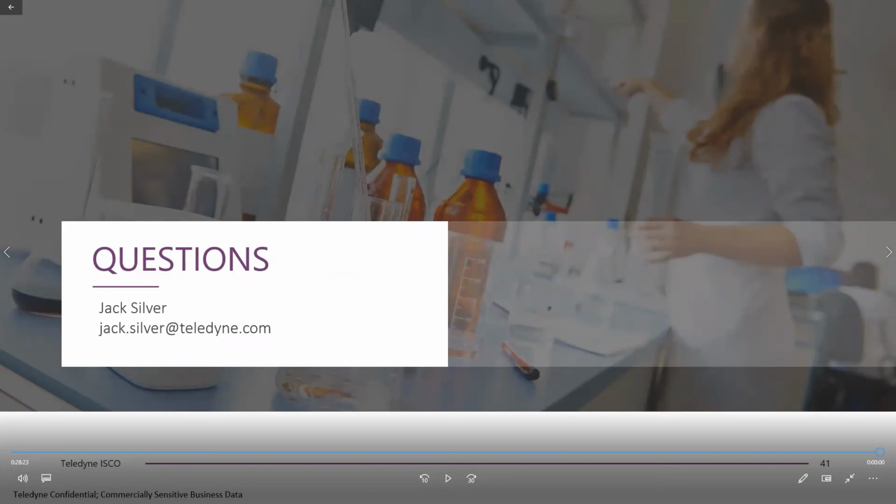Okay, Mahesh, I see your response. Yes, you mix water and DMSO and dissolve the sample in DMSO first, and then you can dilute it with water. And I would also suggest that you filter your sample as well.